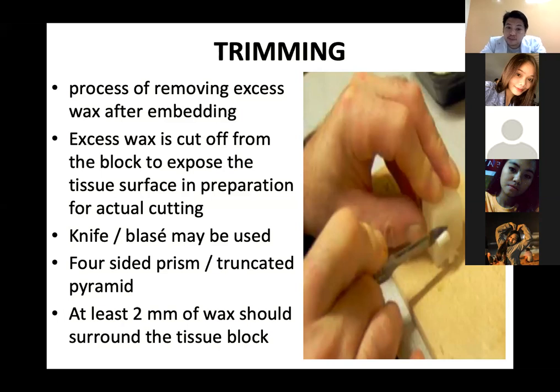So first reason, to expose the tissue. And the second reason is to fit the tissue blocks on the microtome. Okay, so these are the two reasons for performing trimming. So I think that's the end of our discussion.